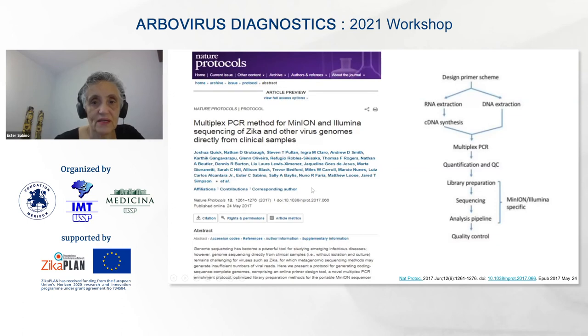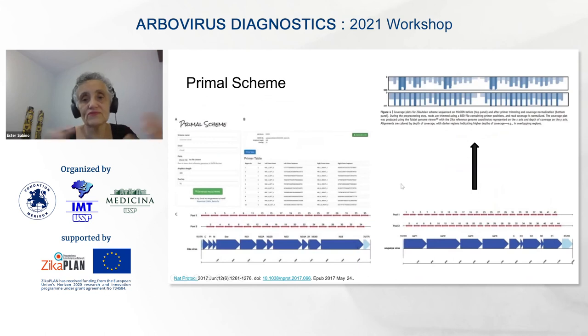and this was done with the group from the UK. This technology was used to do the full length genome. What you do is first a PCR, because the virus is not in a high enough proportion that you can directly sequence without previous amplification. So we design primers that cover the whole virus, and you run these small PCRs in the machine and you get the results.